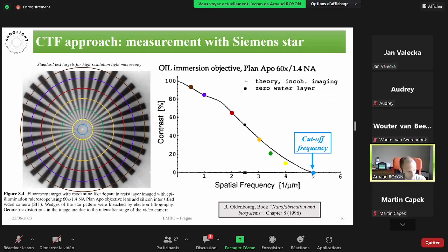The bad news here is that both these samples are not commercially available or not well suited for typical confocal or super resolution microscopes, because the gratings that are commercially available have a large period, and the Siemens star was actually a lab prototype and was never commercial. If you want to find more information, you can have a look at this page.